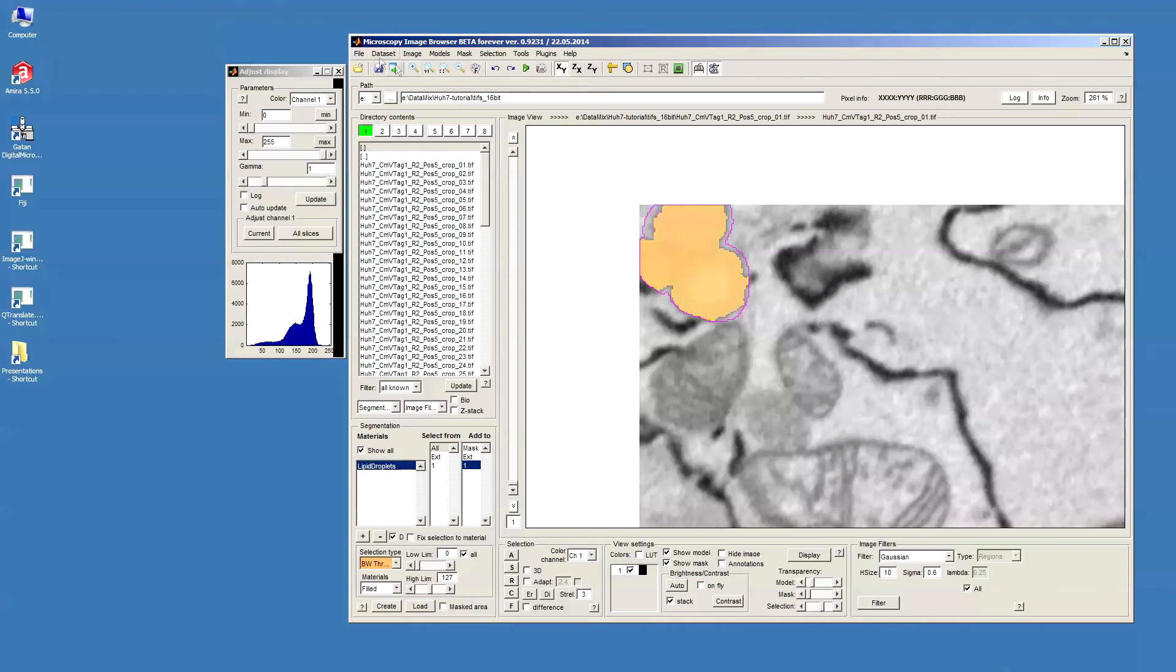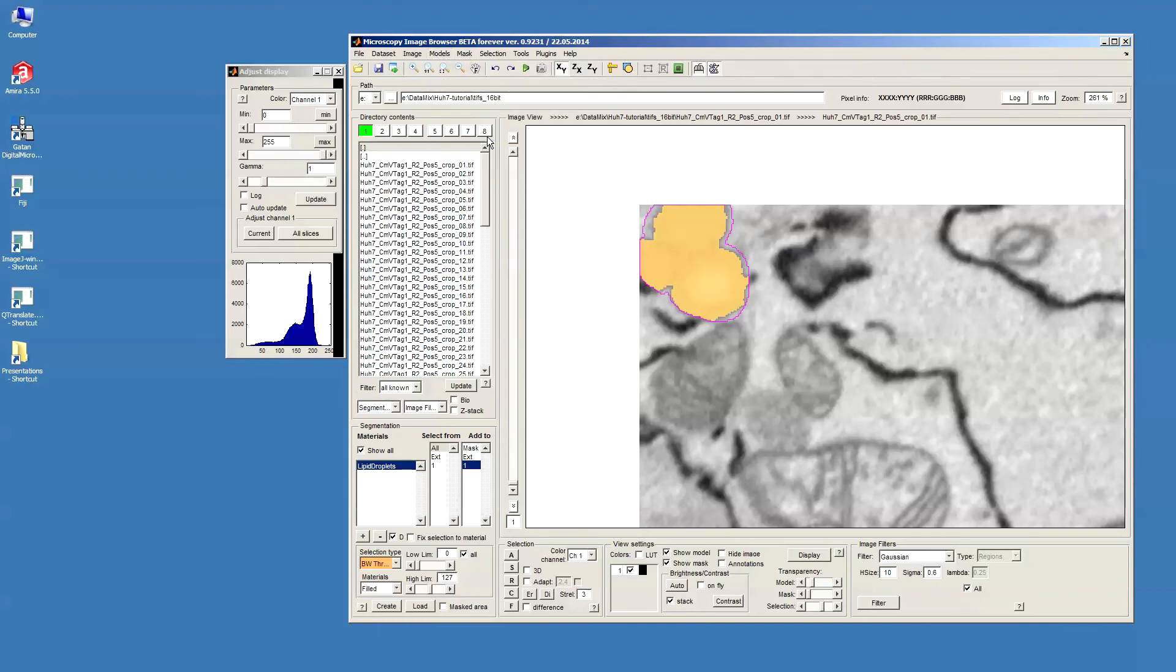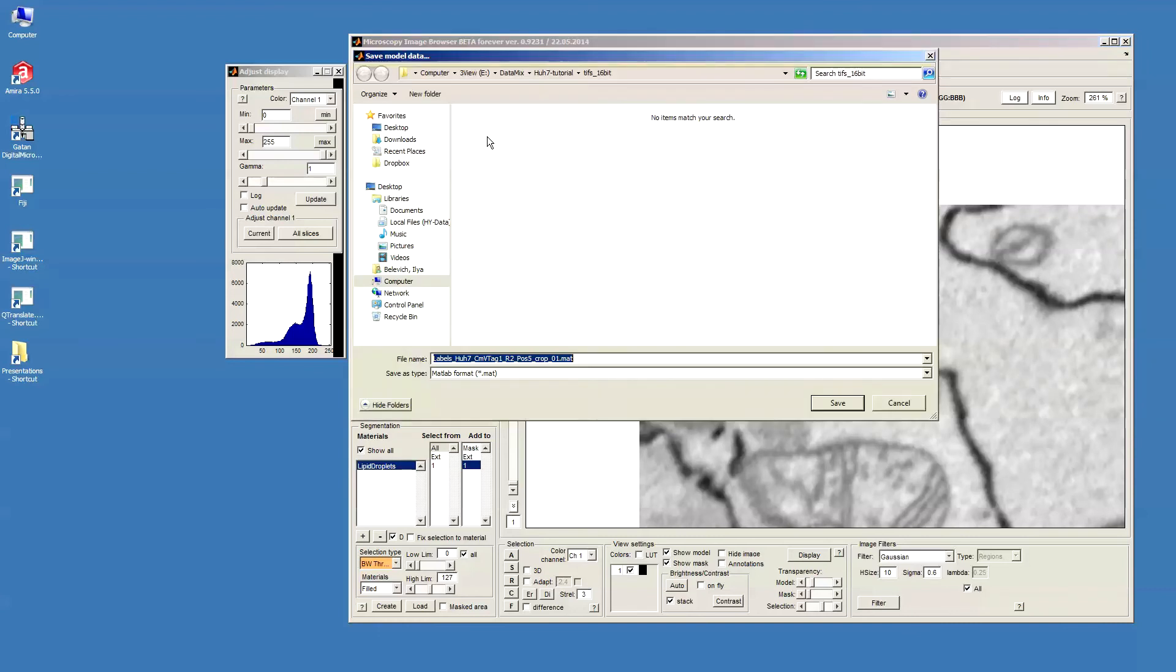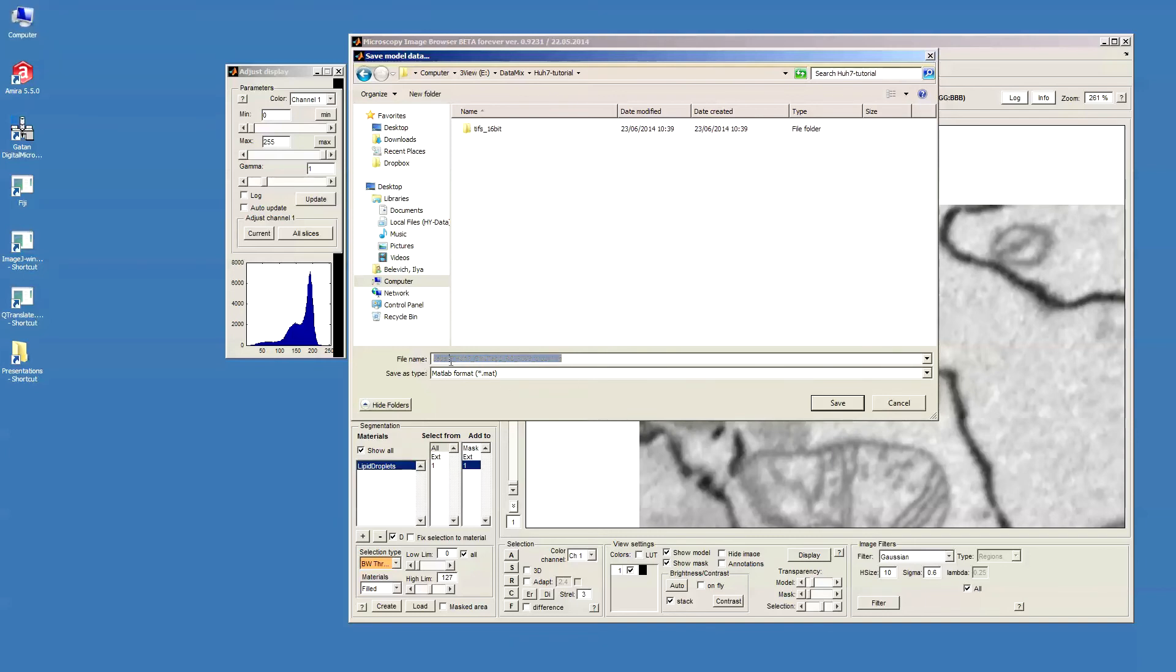Now let's save the model. In order to save the model I will go to model and then save model S. And again I will go to the same directory where I save the data. And by default the MIB browser adds the labels tag in the beginning of the models. So I just save it in this MATLAB format.